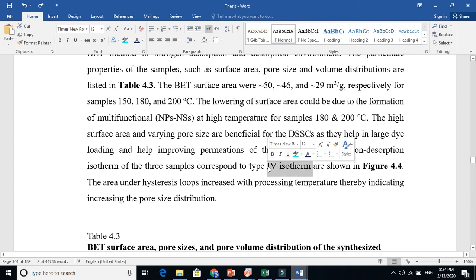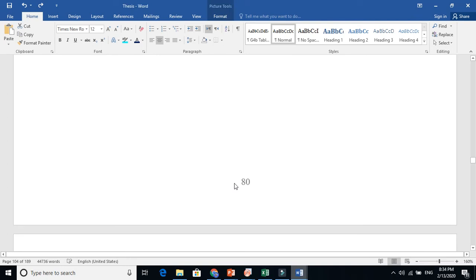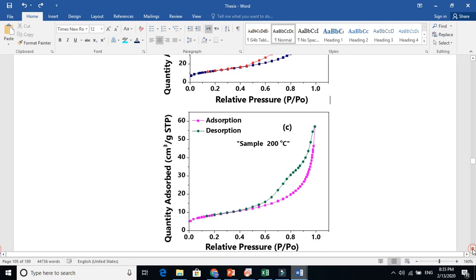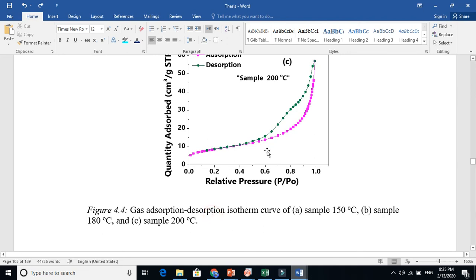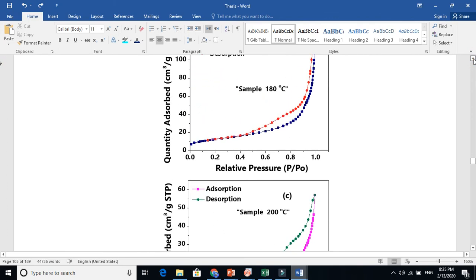The adsorption-desorption isotherms of the three samples correspond to isotherm type four. In BET or gas adsorption studies, there are six types of isotherms and each represents a different microstructure — microporous, mesoporous, and so on. The isotherm obtained here represents a mesoporous structure showing hysteresis. Mesoporous material means pore sizes are from 2 nanometers to 50 nanometers. The x-axis is relative pressure and y-axis is quantity adsorbed.